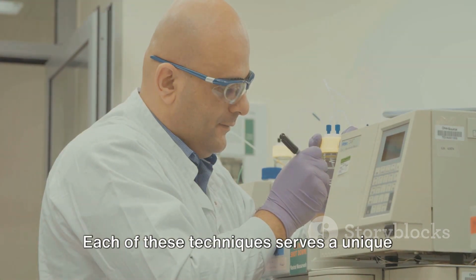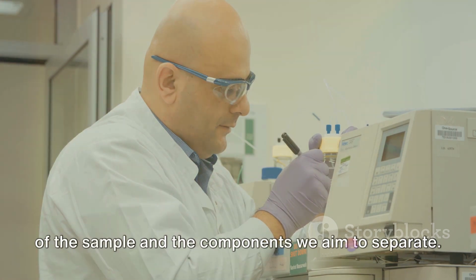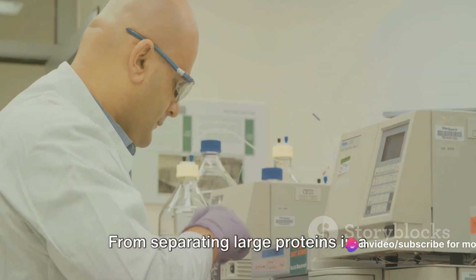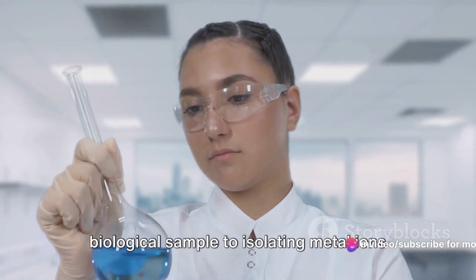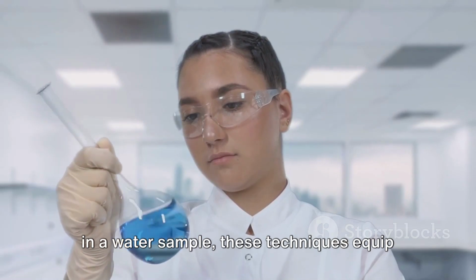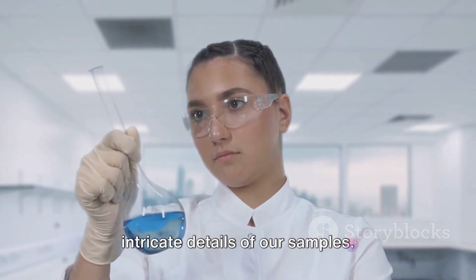Each of these techniques serves a unique purpose and is chosen based on the nature of the sample and the components we aim to separate. From separating large proteins in a biological sample to isolating metal ions in a water sample, these techniques equip us with the tools to delve into the intricate details of our samples.